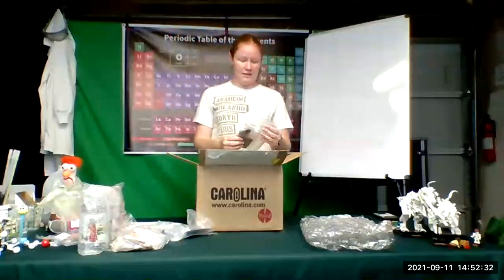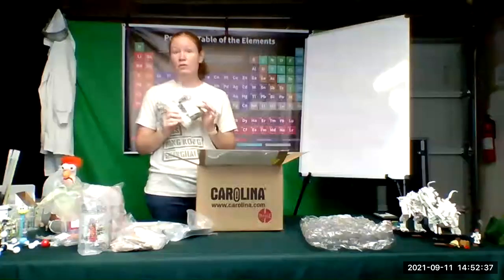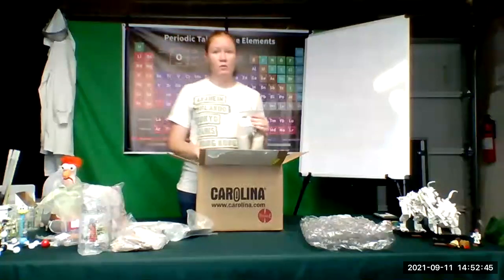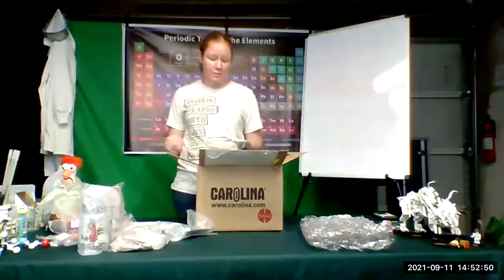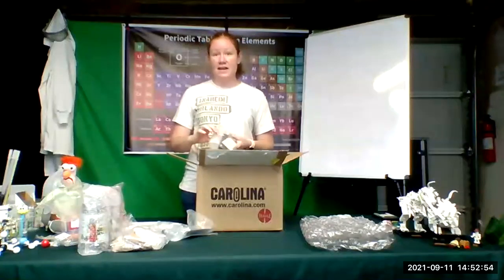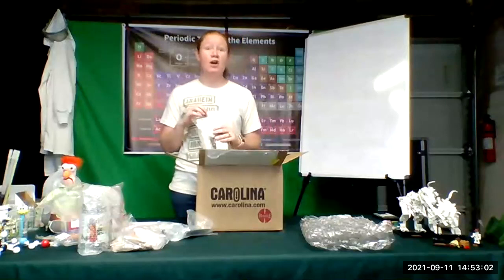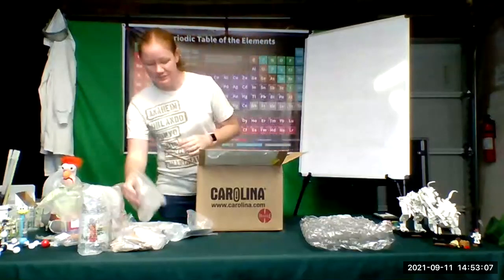Okay. Here is investigating chemical reactions. Now, there's a few things in this investigating chemical reactions packet that we're going to use for our week 13 experiment determining R. So rather than have yet another set of equipment, the protocol for determining R uses the yeast, the stopper, the hose, and the test tube that all come in investigating chemical reactions. And you have enough of the yeast left after doing this that we can do the determining R experiment as well. So some of this you're going to reuse for another experiment.